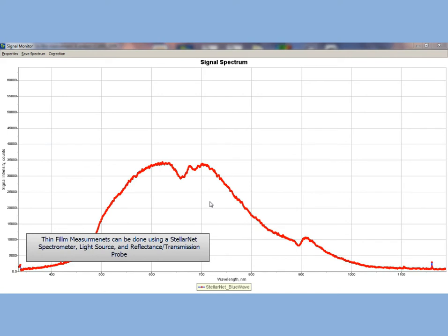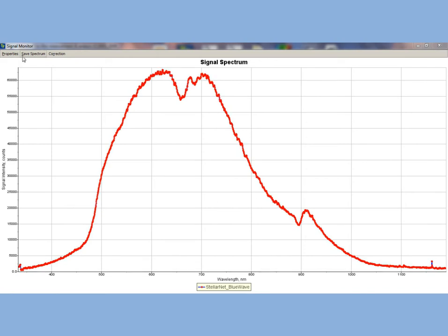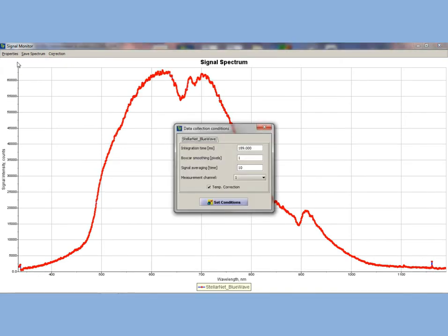Turn on your thin film software and optimize your integration time and probe height using the signal monitor application tab. You can adjust your settings by going to measurement conditions, where you can pick your pixel smoothing, signal averaging, and integration time.